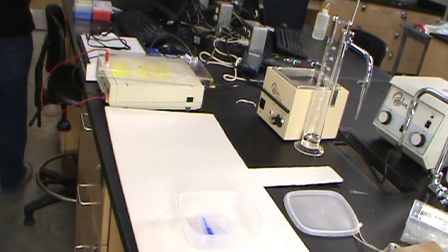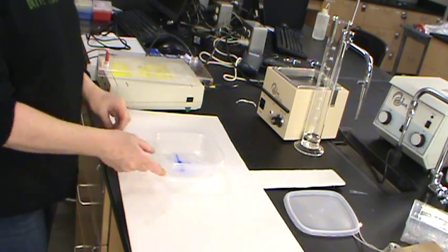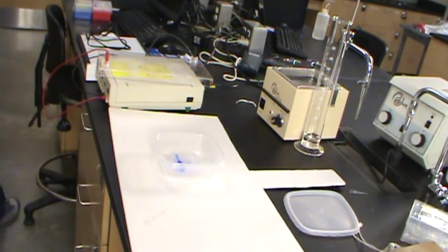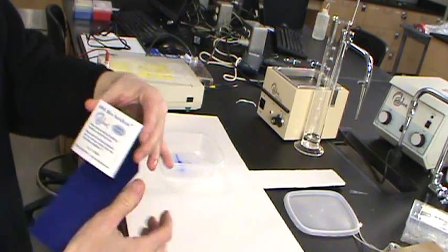Let's move this buffer out of the way here. We'll move our Tupperware container a little bit closer. But what we'll do with this is that we will take a card, and this is called Instastain stain.